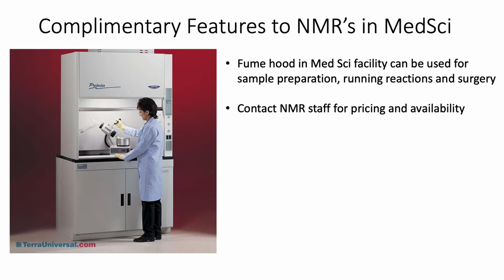One of the exciting complementary features of MedSci is that there's a fume hood located walking distance from most of the instruments. And this is ideal if you have samples that need to be prepared and experiments that need to be run on them really quickly, if you are running a reaction and you're taking out aliquots, or if you're perhaps doing surgery on even a live animal, because the facility is also used for MRI.